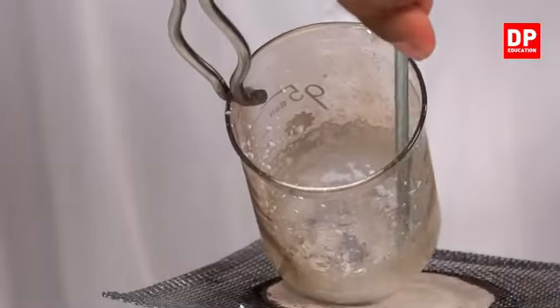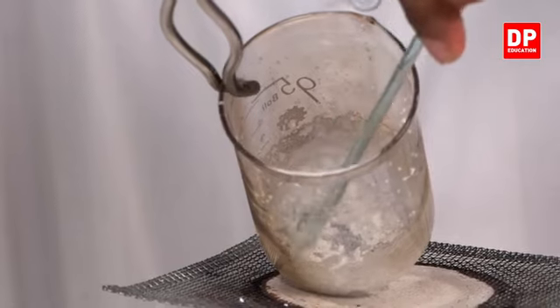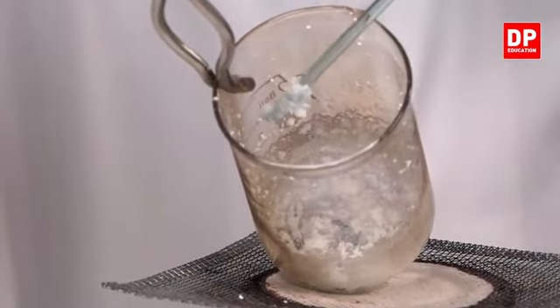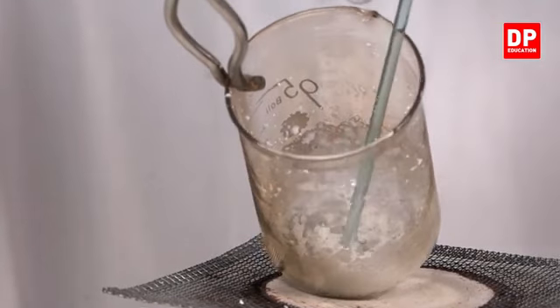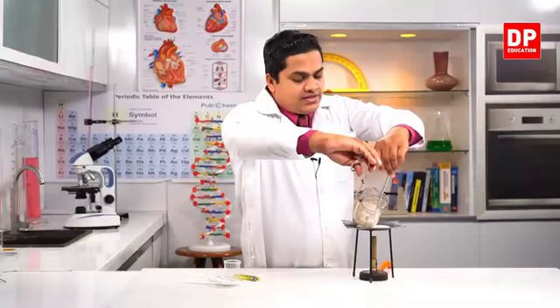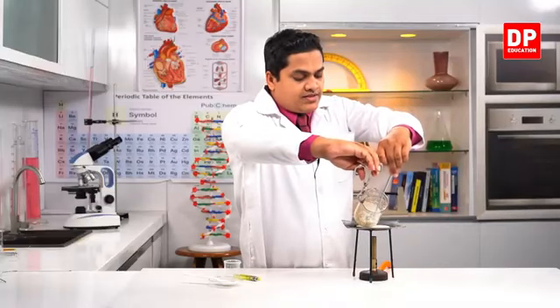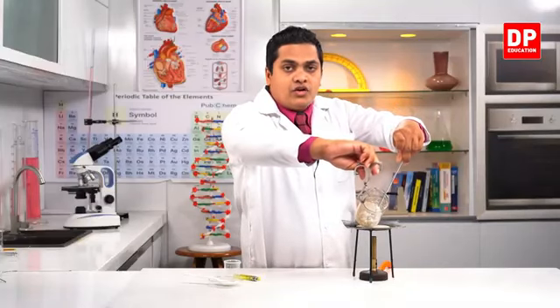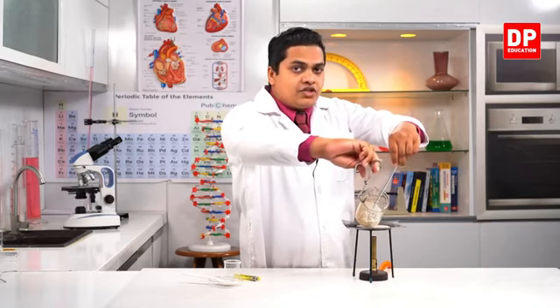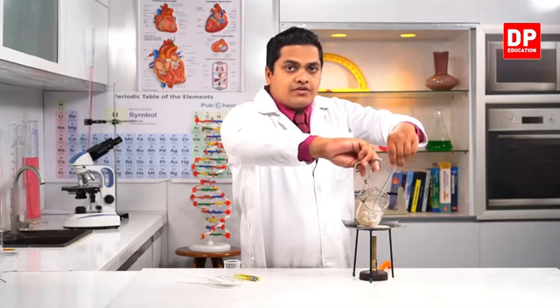See, all the salt that we dissolved in the initial stage can once again be observed at the bottom of the beaker. It's because this dissolving process, dissolving salt or sodium chloride, is just a physical change.